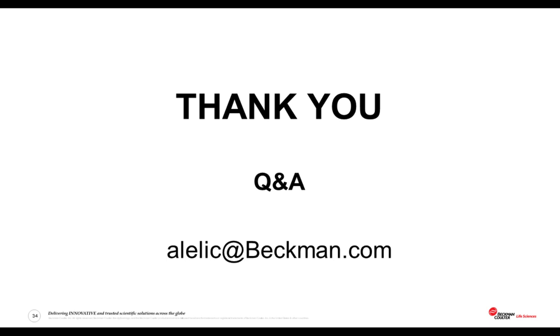Our next audience member says, great presentation, thank you so much. And for the dried down antibody multicolor panels, can you add an appropriate fixable live dead marker? And the second part of the question is, can you add in BV, BUV, or BB conjugated antibodies to the panel?